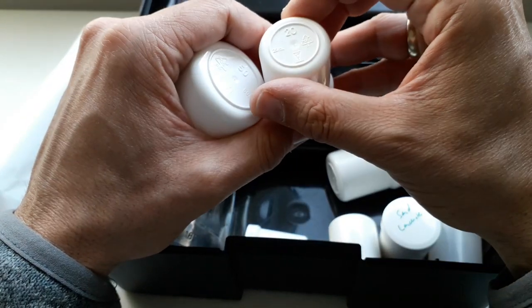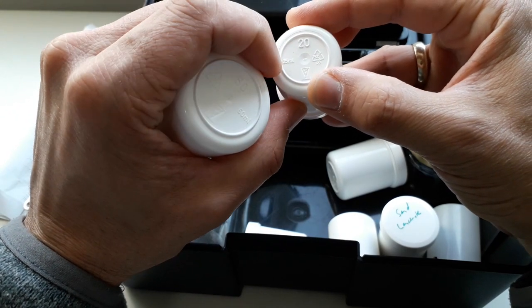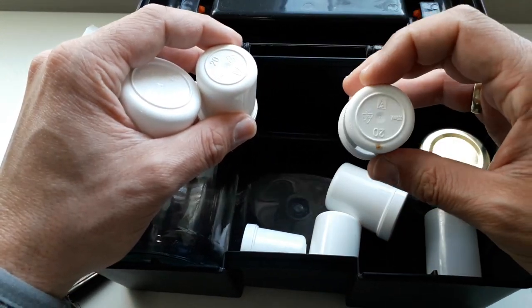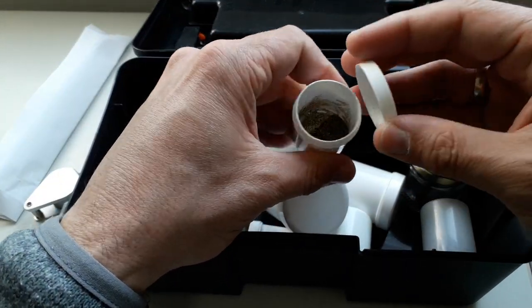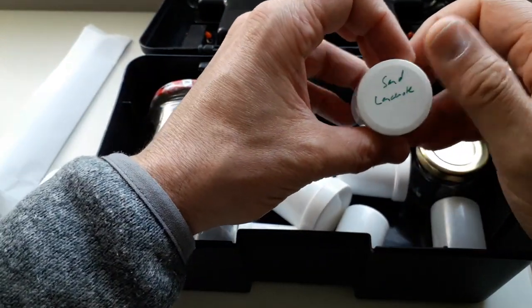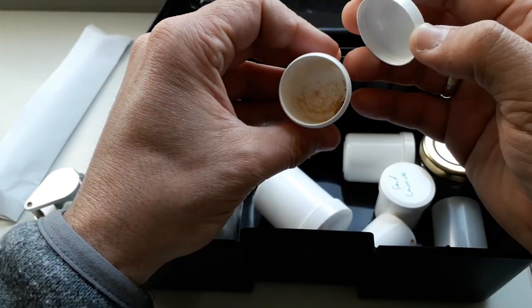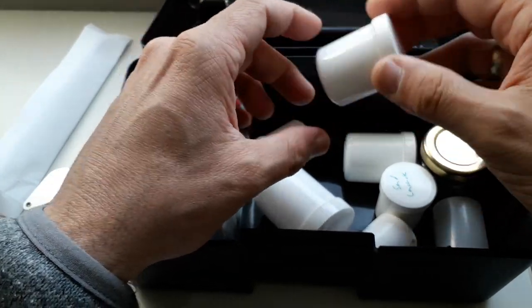This one here has 25 milliliters. I don't know why they wrote 25 here, and then here they wrote 20. I don't know. And what I sometimes do is I simply label them. So that's, for example, a sand sample. Then it's a permanent marker, and I can simply use some alcohol to remove it again. And what's this here? Pollen. Yeah, that's spruce pollen that I collected some time ago. So they are quite useful.